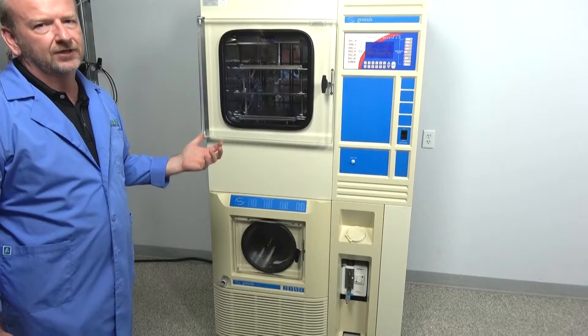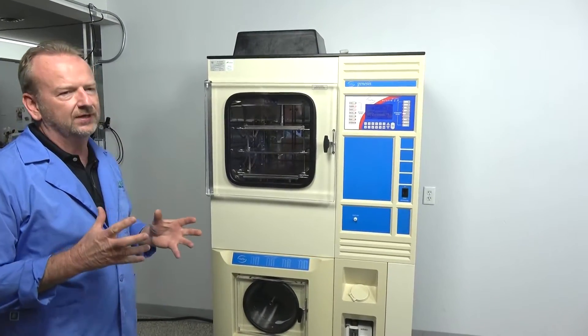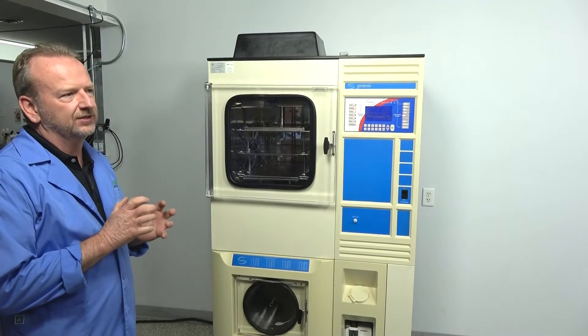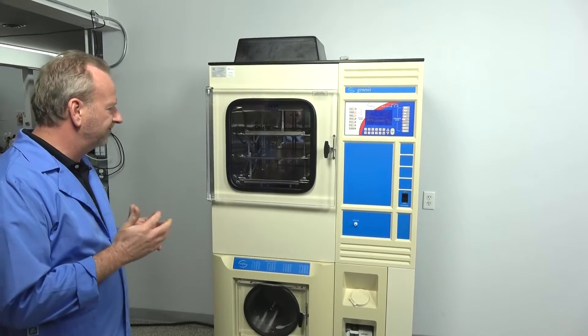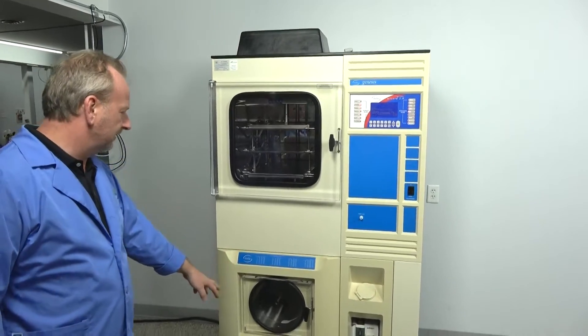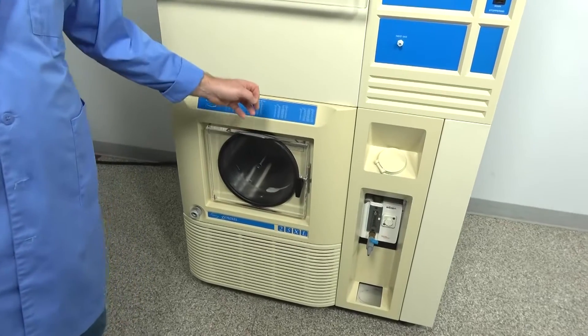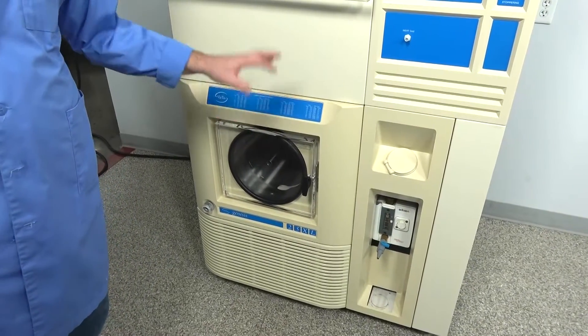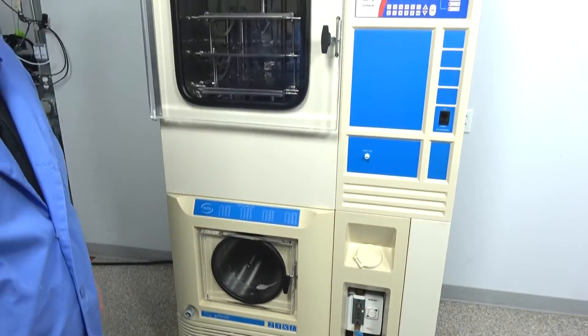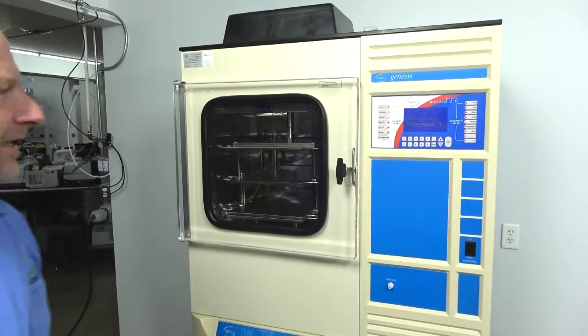This has what they call auto cascading refrigeration, which essentially means it's running on one compressor with multiple refrigerants to make it a little more efficient, while still reaching really cold temperatures in the condenser. The model is the 70, meaning it gets down to negative 70 in the condenser — or even a little colder, as you can see on the screen. It's actually at negative 76, which is typical of these.